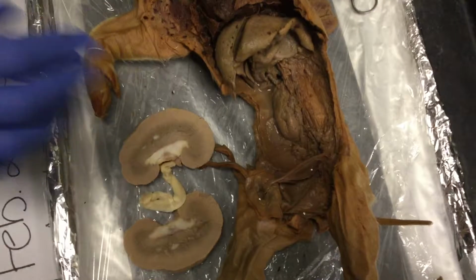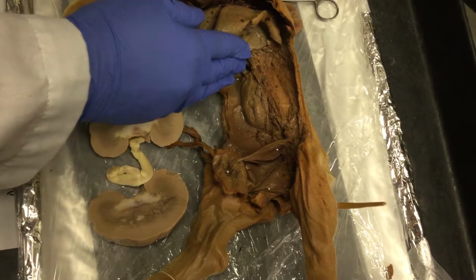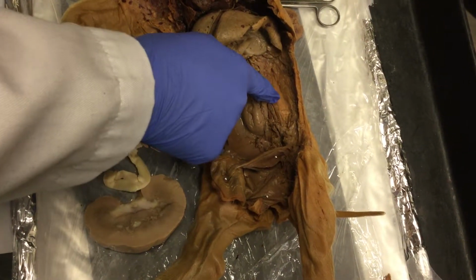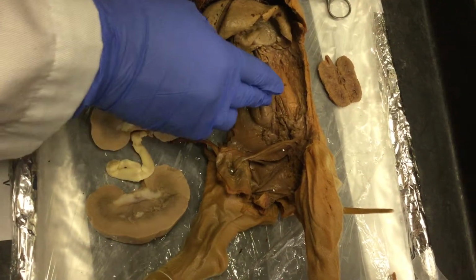All right, so in order to observe the kidneys here, we actually had to remove the small intestines and the large intestines, and I had already removed a kidney in this area, as you can see. I'll point that out later. So normally, yes, there are two kidneys.